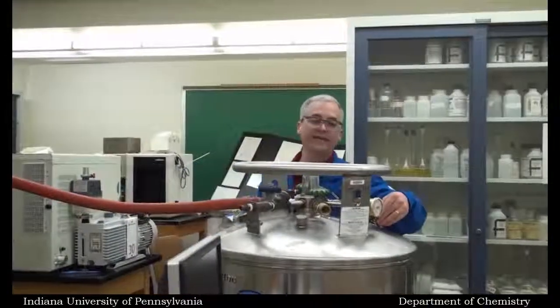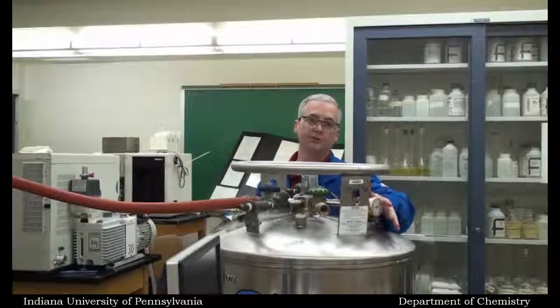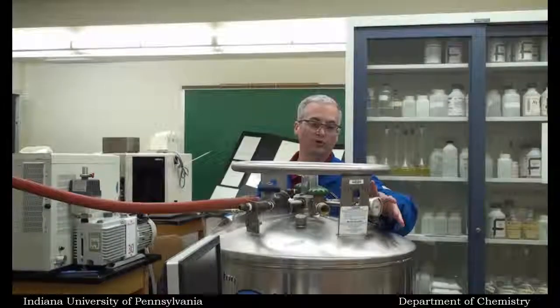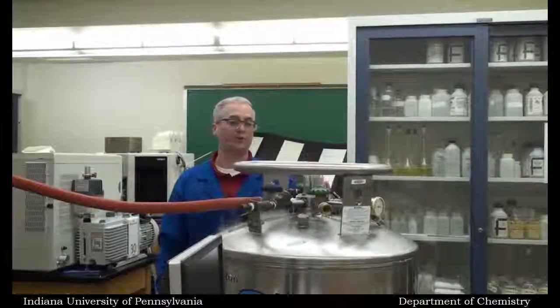Once you do have it vented down to 50, I would leave it at 50. I would never repressurize it because you're going to lose a lot more gas, a lot more liquid in the liquid nitrogen Dewar, and the Dewar won't last as long.